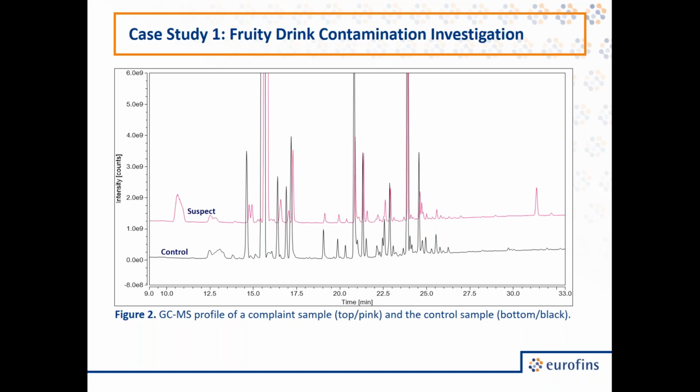As you can see here, and as Jamie described, we have the chromatogram, and then each of these peaks that you can see is also identified by the mass spec fragmentation. In addition to that, we can compare intensities of the peaks, which is related to peak height and peak area. So if a peak is wide and tall, such as the one here at around 16 minutes, compared to a peak that is very small, that would mean that likely you have a lot more of that compound present. However, these intensities are relative, so we wouldn't compare between compounds because different compounds might have different responses even when they're present at the same amount, but we can compare between samples.